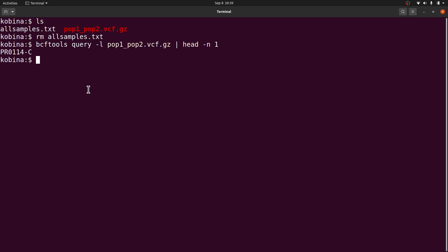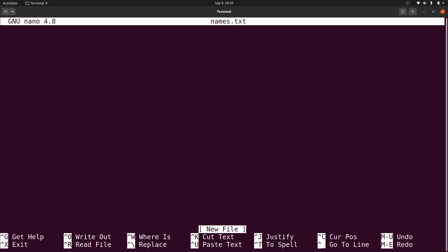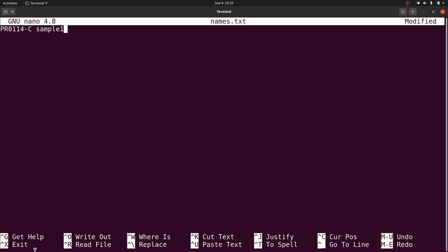The text file will have the old names — the ones you are going to rename — as well as the new names that will replace them. I'll create a text file using nano: nano names.txt. I'll paste the old sample ID, then add a space and type the new name: sample_one. You can use any name of your choice. Then I'll save the changes.